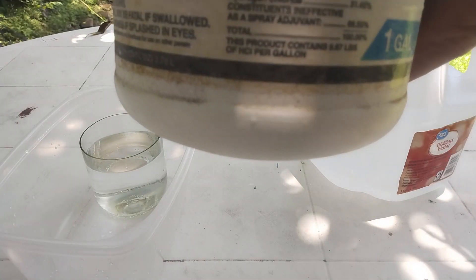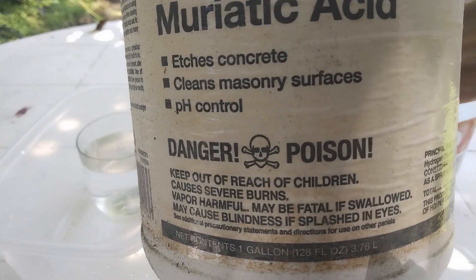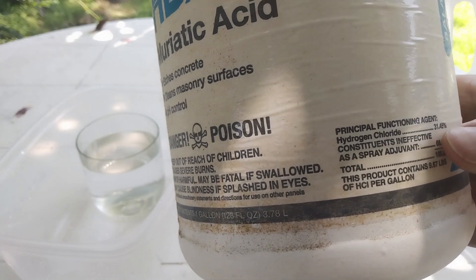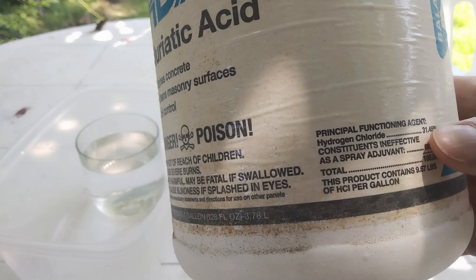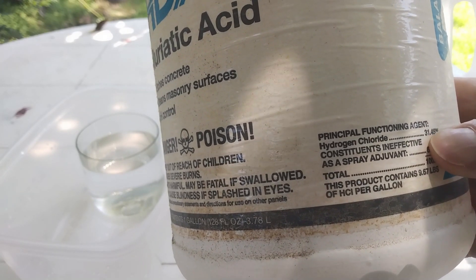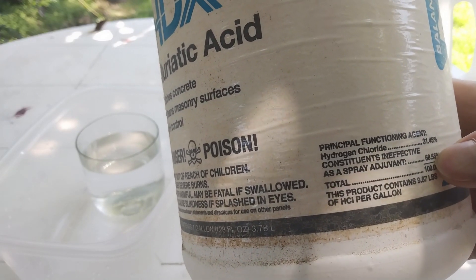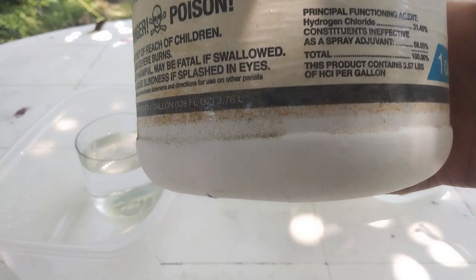What I'm using here is muriatic acid that I got at Lowe's. It's impure because it says the principal functioning agent is hydrogen chloride at 31.45%, but the rest is spray adjuvant, so we have no clue what this is. So it's definitely not pure.